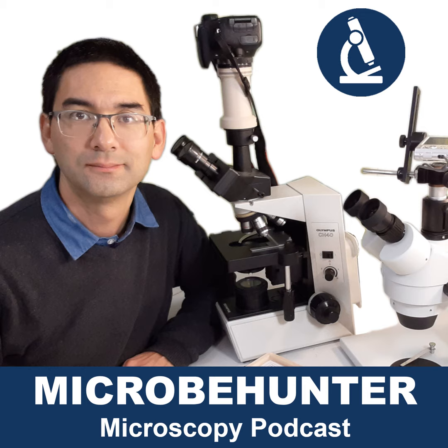So you're asking me where should I take the sample from, and the answer would be, well, it depends a little bit on which type of parasite it is. I'm not able to give you an answer here. Or should I look for the adult specimens or larvae or eggs? Again, it depends on the type of parasite. And if you are able to see something in your stool, for example, provided that those eggs are large enough, then you know that you have to look in the stool, and then you're able to find maybe the eggs.